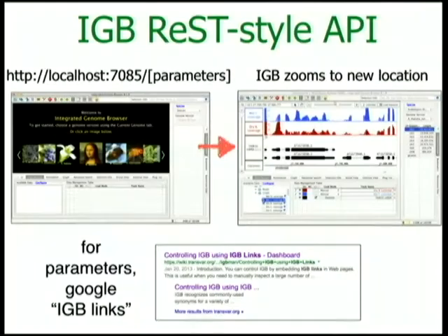Okay. All right, so now I'm going to switch gears and for my remaining couple of minutes, talk about another way that IGB is turning out to be really useful these days in the context of big data and genome science. And this is another feature that's actually really old. So when Greg first developed this software many years ago, our idea was that we wanted to link the software to Affymetrix's website. So we wanted people to be able to go to probe set pages, click a button, and then go to IGB and visualize the alignment of probes and probe set design sequences onto the genome.